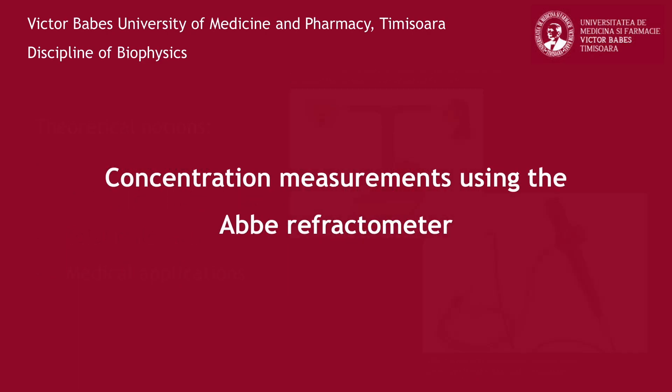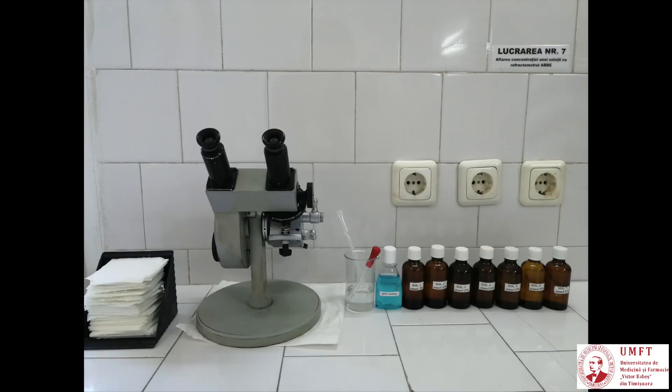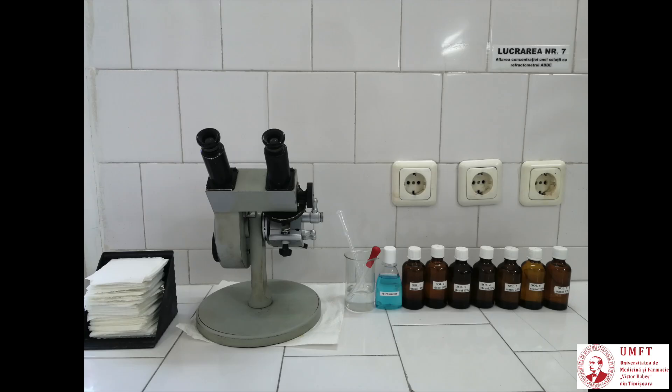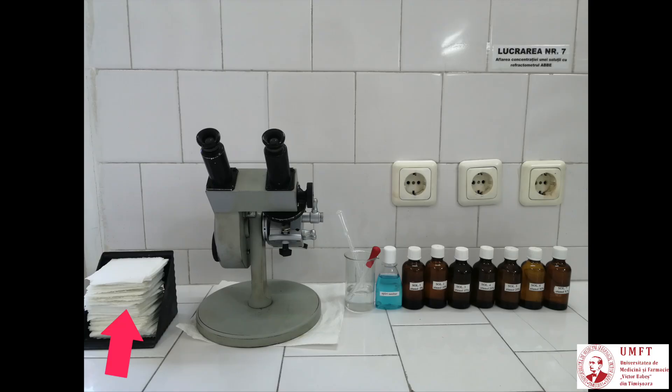In this practical work, you'll measure the refractive indices of some solutions using the Abbe refractometer. Then, using the measured values for solutions of known concentration, you will determine the unknown concentration of another solution. To this end, you will use an Abbe refractometer, seven aqueous ethanol solutions of different concentrations, distilled water, rubbing alcohol, a Berzelius glass, a pipette, and powder-free paper tissues.